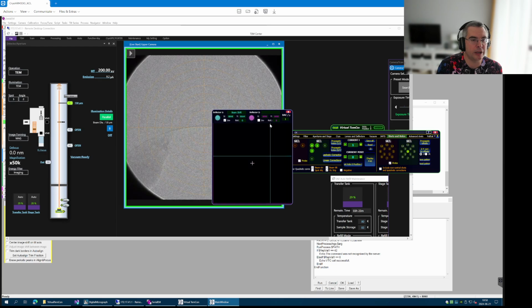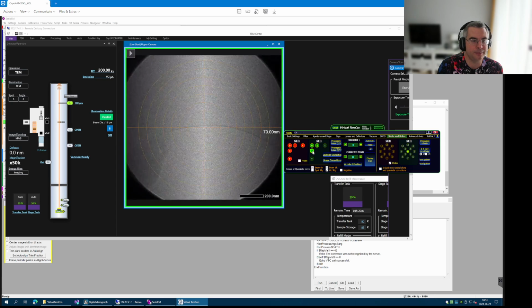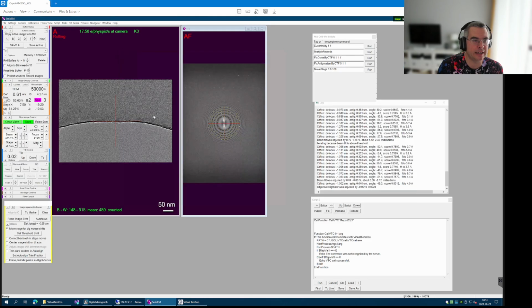My TeamViewer connection quality is not great, but yeah, it should do. Okay, so we've got something like this. Then we get it as hole 1. Super. And then we go to hole 3. So we set hole 3. And we have to do this exercise again.